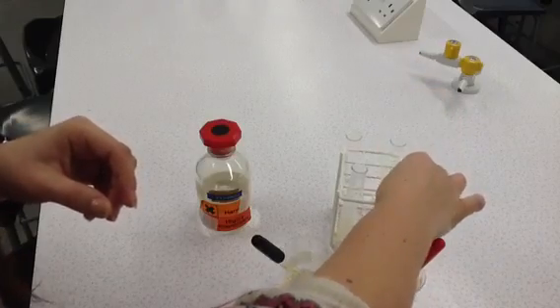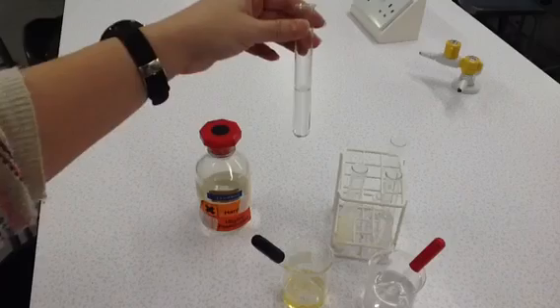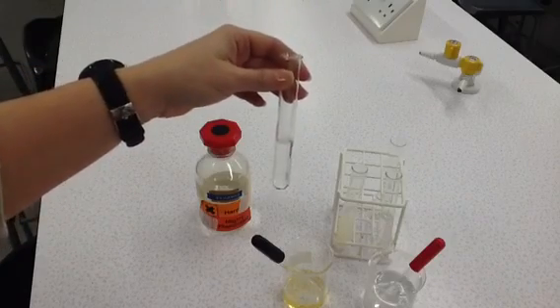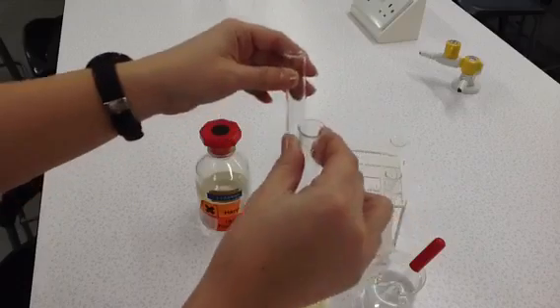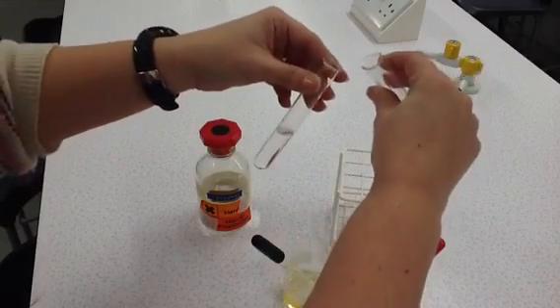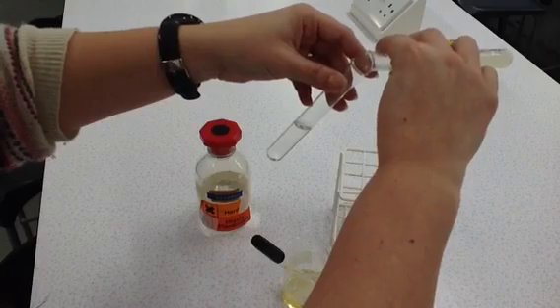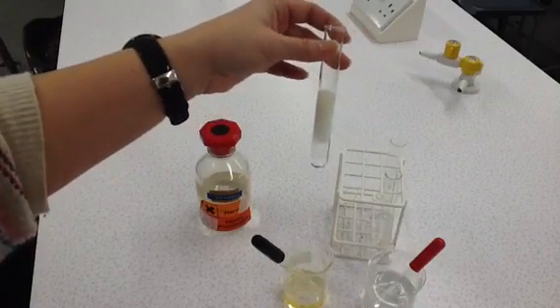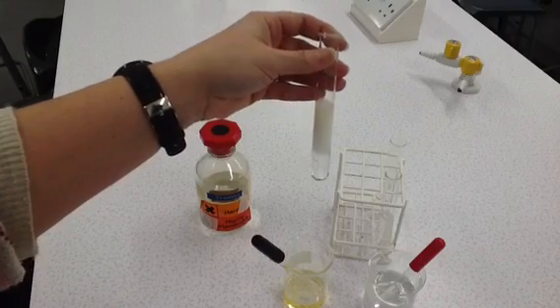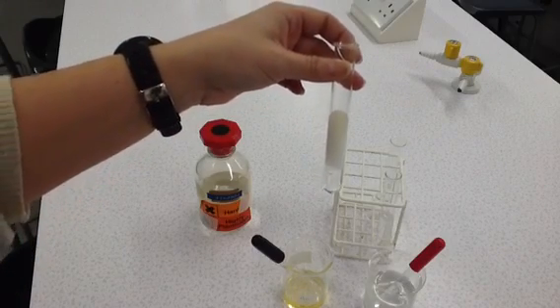And then we take a second test tube, which has just some distilled water in, and we take our tube that has our sample in, and we, what we call decant. So we pour our sample into the tube with water, and as you can see here, the solution has turned a milky, what we call a milky emulsion. It looks like white emulsion paint.